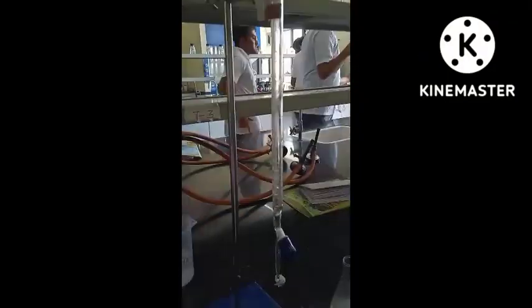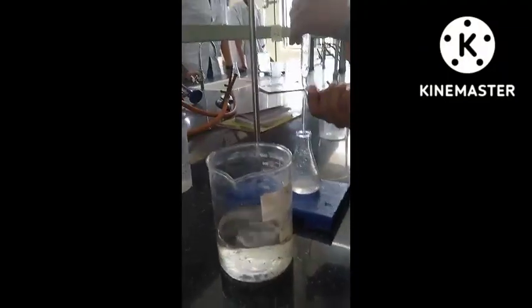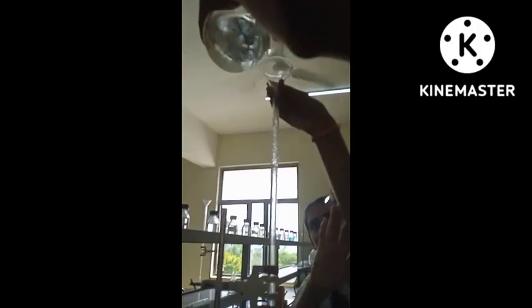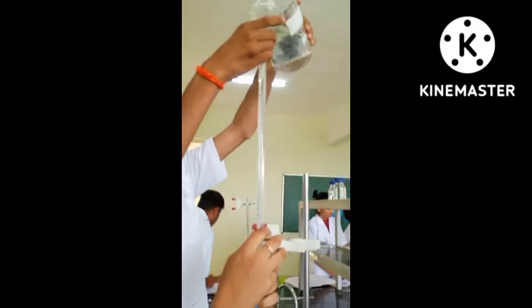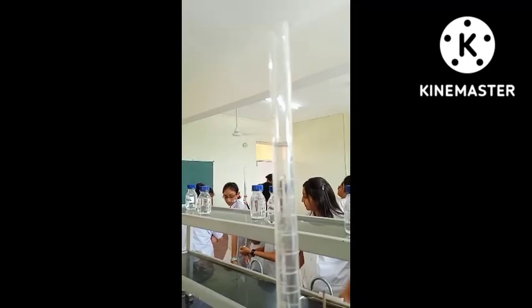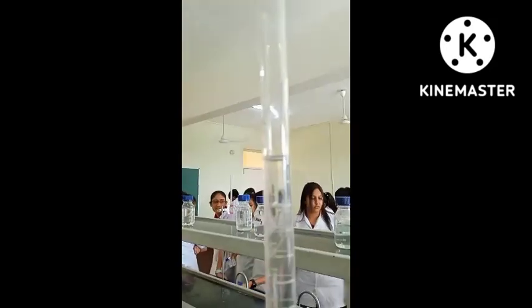So here this is a burette stand, and this is a beaker in which NaOH is there. Now with the help of a funnel, we are just adding NaOH into a burette, until 0.0, the initial reading, that is 0. You can see it clearly.